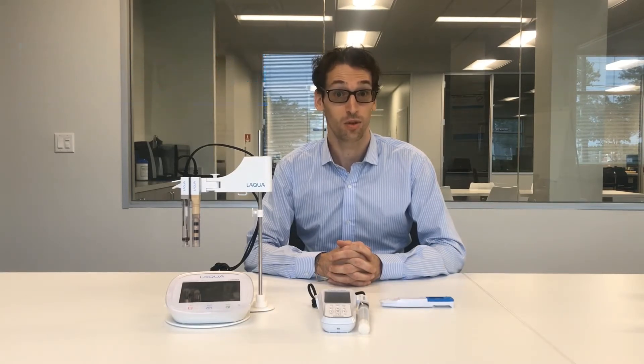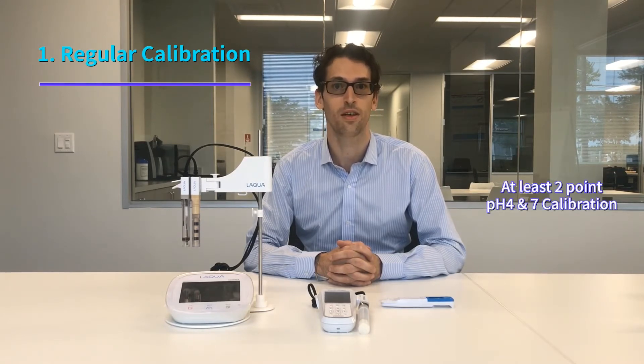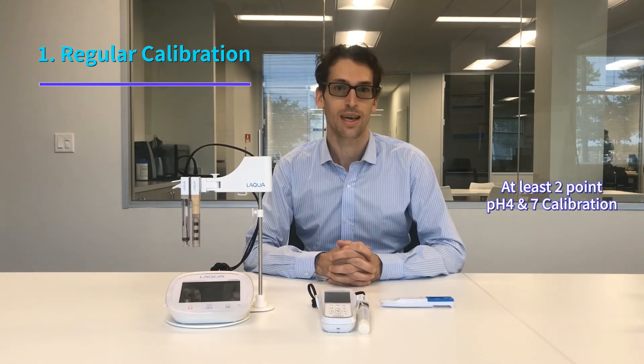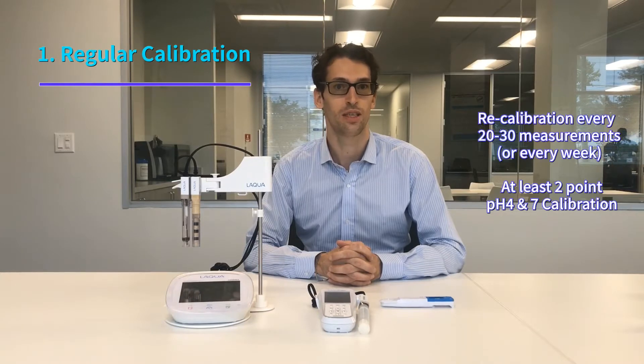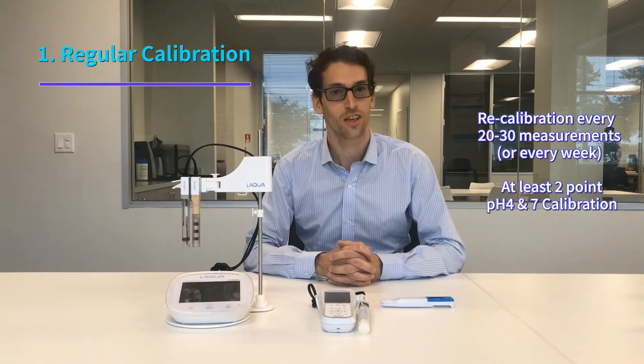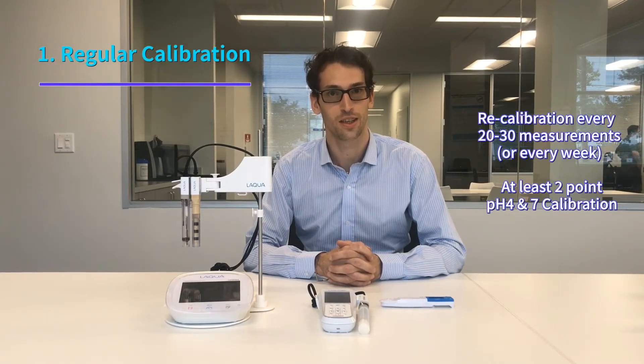The first thing you need to know is that it's important to do a regular calibration. The calibration is a reference point for your pH meter. It can be done from one to five points, but usually our customers will calibrate their meter in two points with the pH 7 and the pH 4 solution. For pH meters we recommend doing a weekly calibration, but if you measure a lot of samples in one day you can do a calibration every 20 to 30 measurements. Always remember: the more frequently you calibrate, the more accurate your results will be.